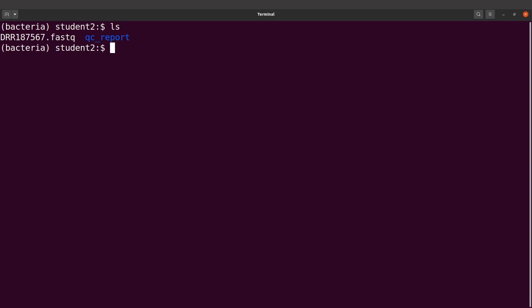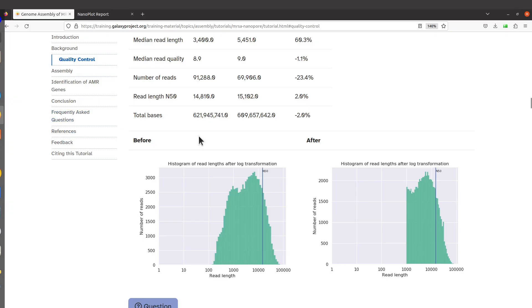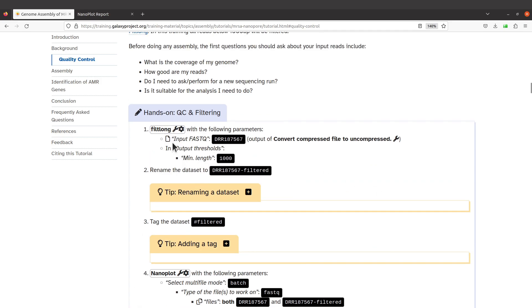Let's do an ls to look at the file again. What we are going to do next is filter the reads — we are going to remove reads with lengths shorter than 1000 bp. Looking at the Galaxy instructions, we have minimum length set to 1000. We are going to use Filtlong, which we have already installed. Filtlong will remove all reads with length shorter than 1000 base pairs.